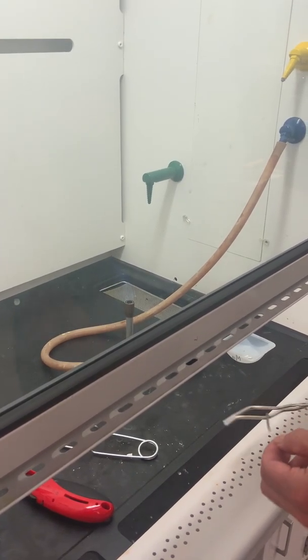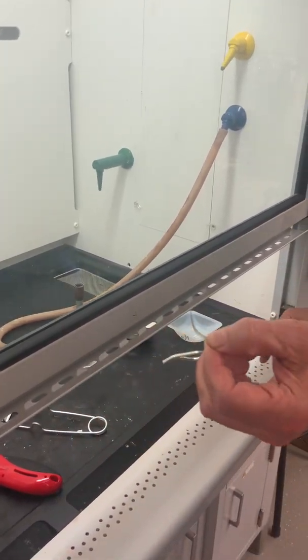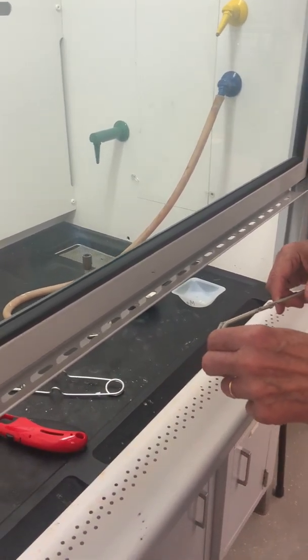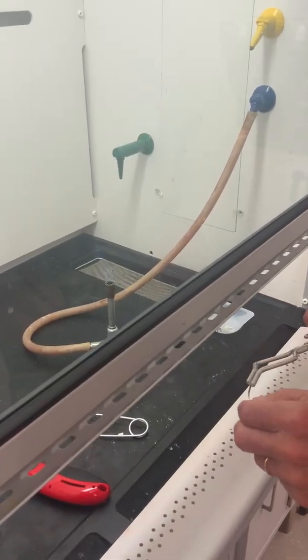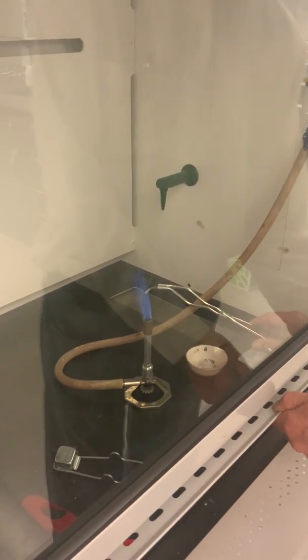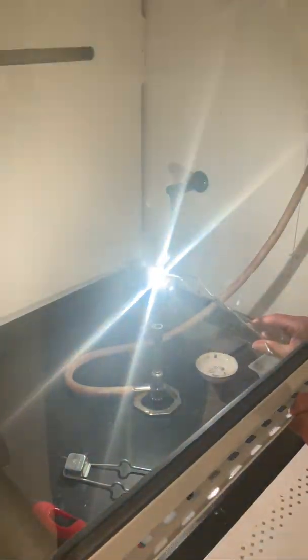If I were to leave this piece of magnesium out on the bench for a year, we could accomplish largely the same transformation. But here the heat allows us to accelerate the rate of the chemical reaction, by exciting those molecules. Woo!